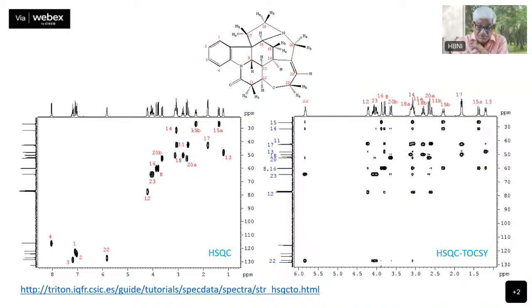So these are 15A, 15B. Carbon 15 is here, and this is connected to A and B, these two there. Now look at the next one, carbon 14. Notice here we are talking about one-bond correlations only. In the HSQC, we are seeing correlations to the directly attached proton, so the carbon on one side and the proton on the other. You see 14 is one carbon, directly attached to only one proton.